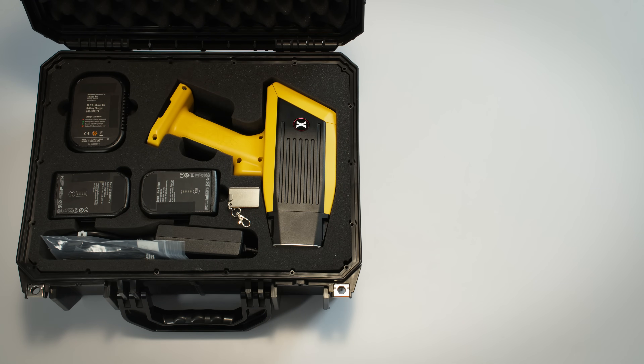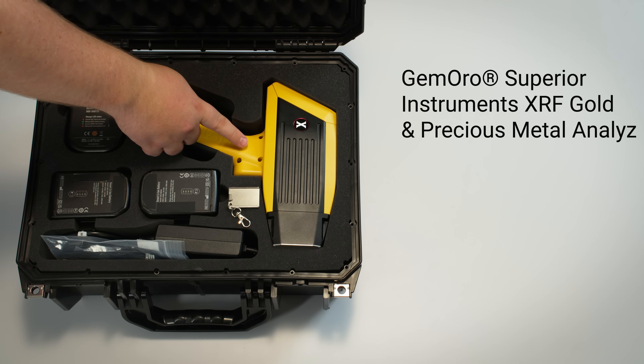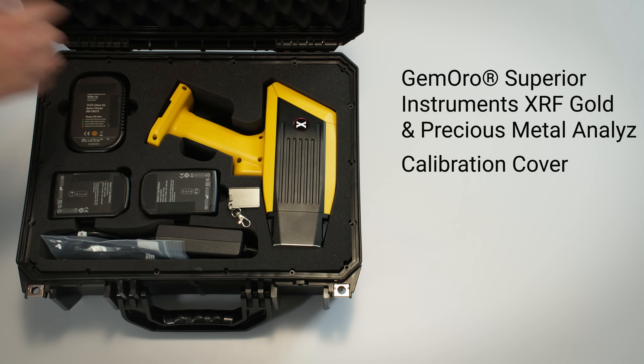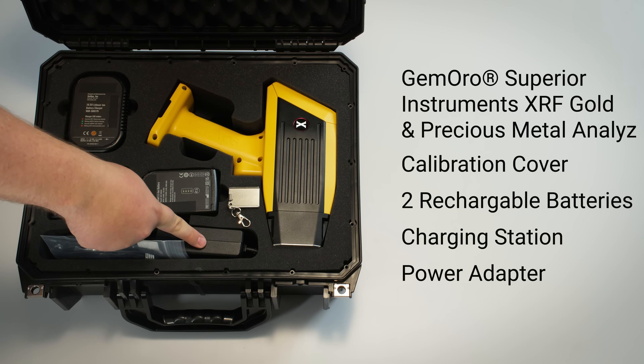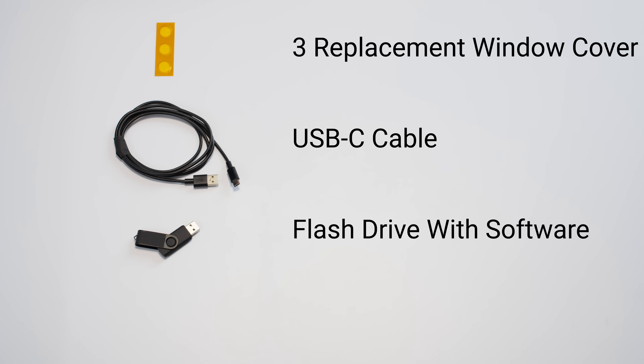When you open the box, here's what you'll find: the Jamoro XRF analyzer, a calibration cover, two rechargeable batteries and a battery charging station, a power adapter, three replacement window covers, a USB-C cable, and a flash drive with software for the device and a screwdriver.